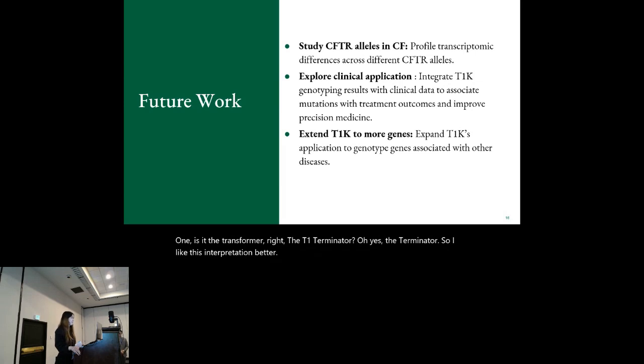Is it available as a package for people to download and run as a command line app? Yes, basically all you need to do is go to the GitHub and follow the instructions there. It's super easy. You basically just need to run the command line, and it's super straightforward.